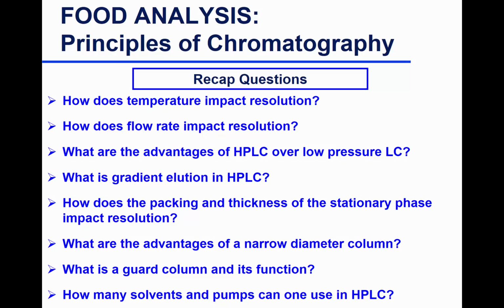In general, with HPLC, you do have 2 pumps if you commonly use a binary system. So you get mixing under pressure after the pump starts in each mobile phase. But yeah, you can have up to 4 different solvents at a time. You can have 1, you can have 2, 3, or 4.